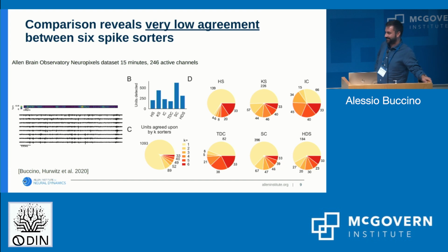So you think that if anything, we should be spike sorting in much smaller bins? No, but it would be worse because you probably would have some drift, so then you'd need appropriate drift correction methods. And 15 minutes, this data set was actually handpicked because it was quite stable. But for some people that do, for example, 48 hours of Neuropixels recording, this question comes up.